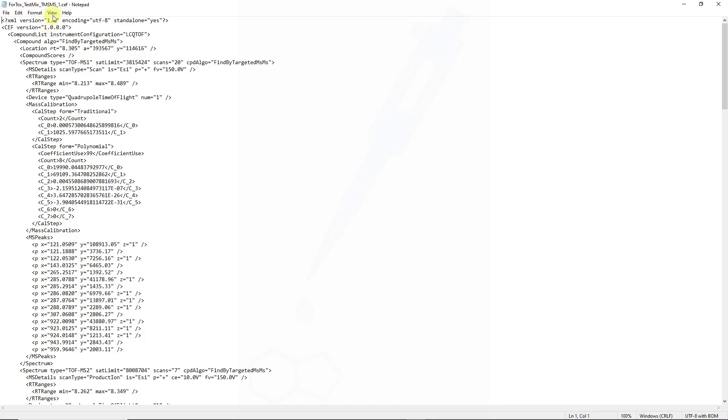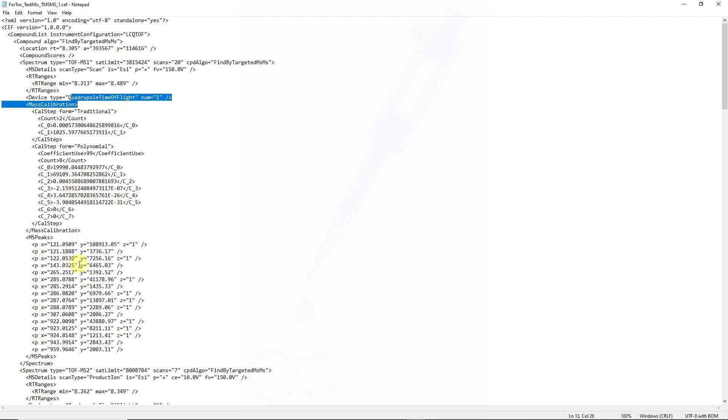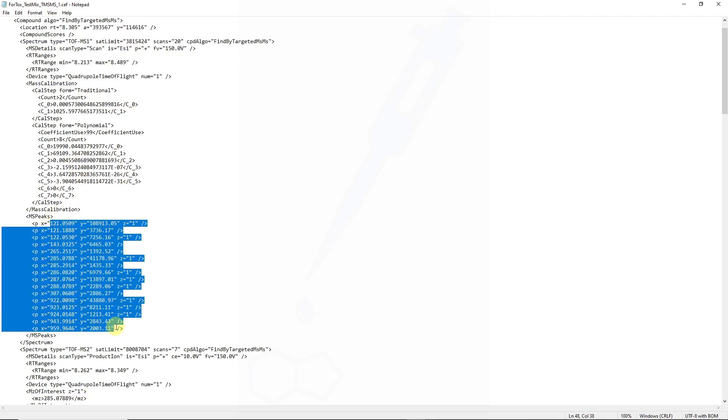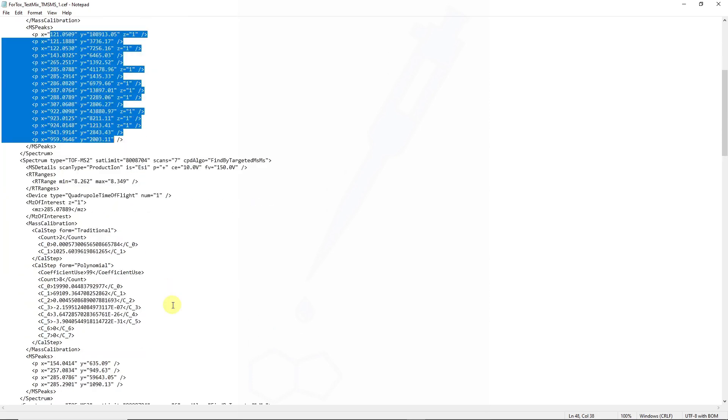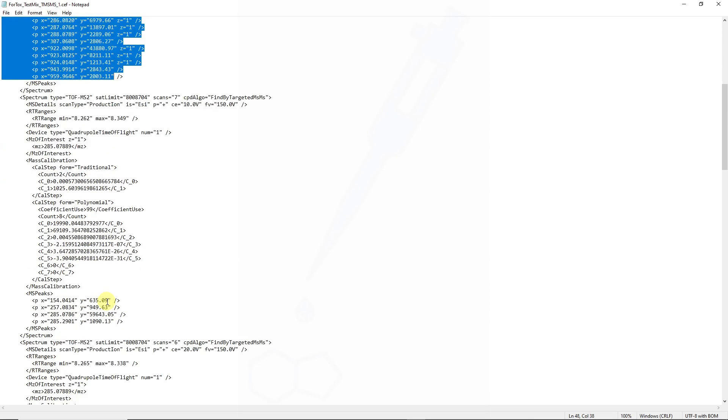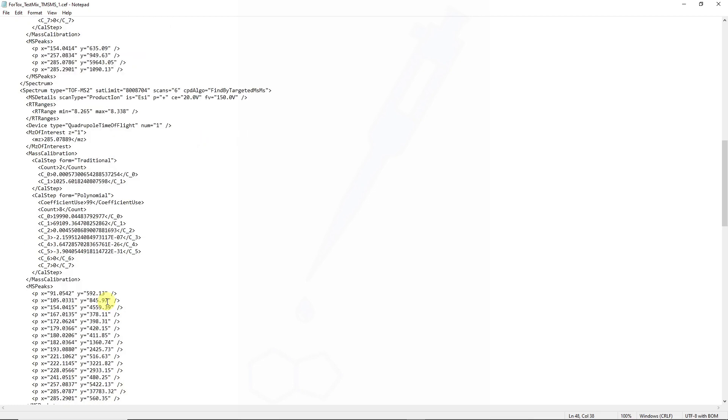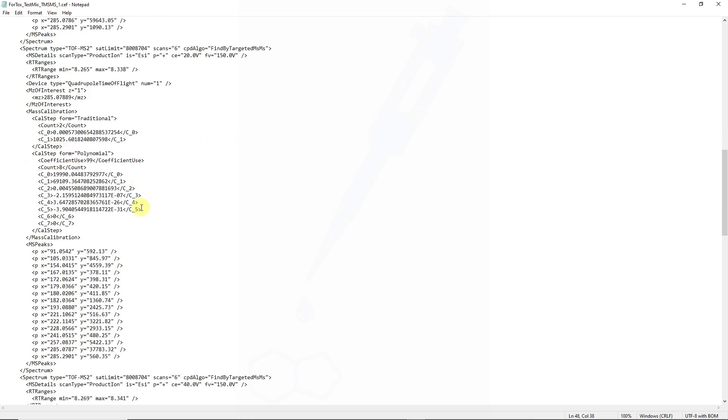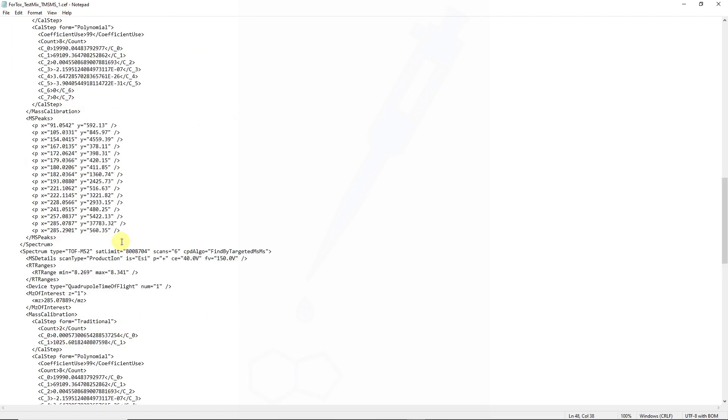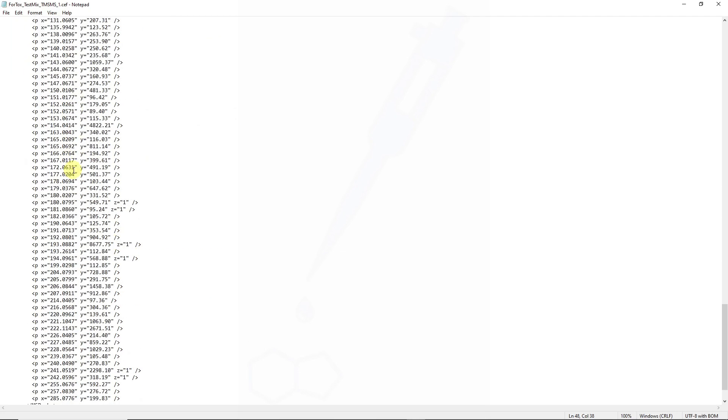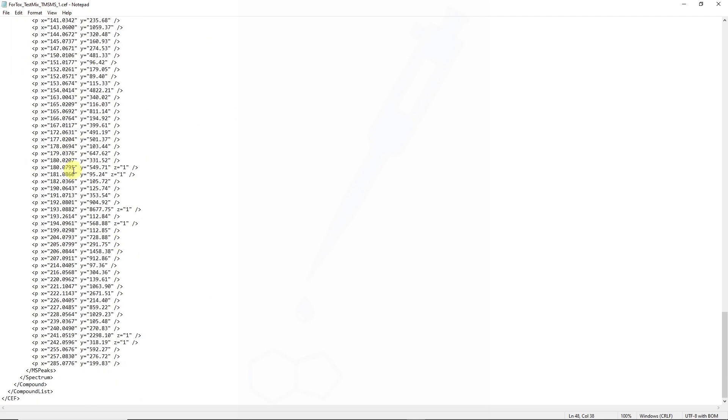You can now see what information is contained in the CEF file. We can see the peak location, probably some details regarding intensity, what type of device it was acquired on, and some idea of those calibration actuals, as well as looks like the coefficients that were used in the QTOF, calibration peaks, as well as MS fragmentation peaks.